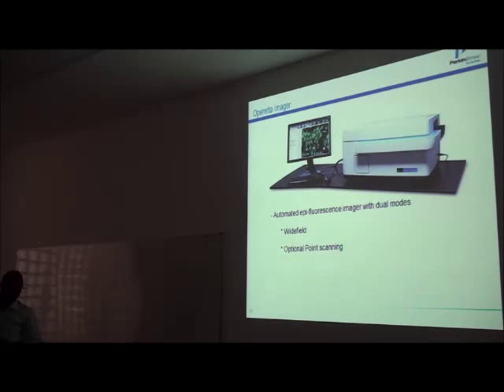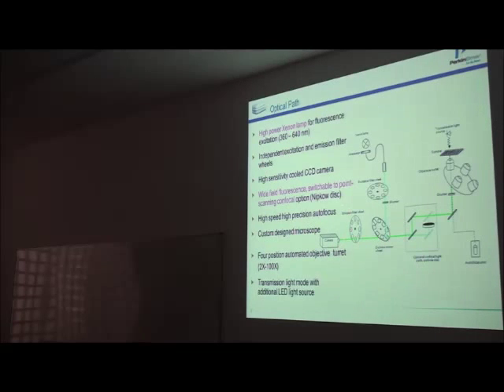It's an automated imager, which can work in confocal or wide field. And the user can select the optical mode from the software, right? And you can move vice versa. Physicists would probably not like it because it's a closed box, but it's not a microscope in a box, but you have all the different components inside. Now, when you look inside the box, for instance, this is the excitation that we use, a xenon lamp, which will give the different wavelengths for excitation.